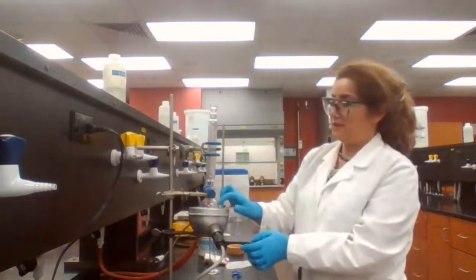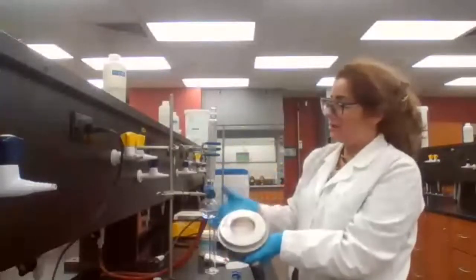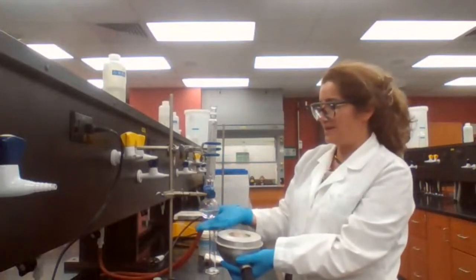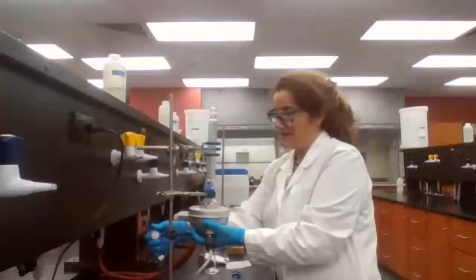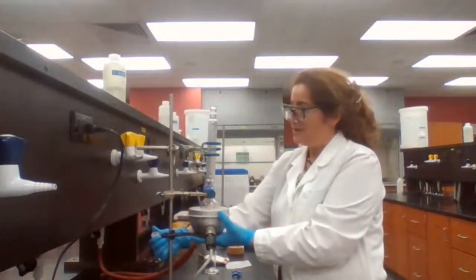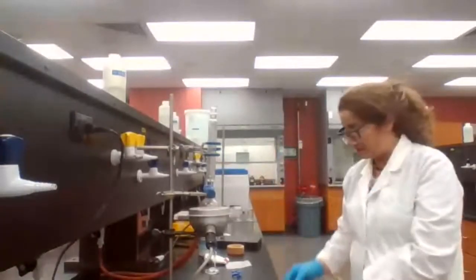The heating mantle is what is used as the heating source for reflux, because the shape of the heating mantle, when you have this round shape, is going to contain the heat, and the flask is going to be heated up more evenly. It's not like a hot plate where only the bottom of the flask is being heated up. So you have that nice shape of the heating apparatus that is going to have a perfect fit. And if you remember from the other experiment 12, we used a different shape of the heating mantle. It wasn't just a different shape, it was a different size. The opening was set for 250 mL. That was for this flask, so we had to use a different flask. So we used the other one.